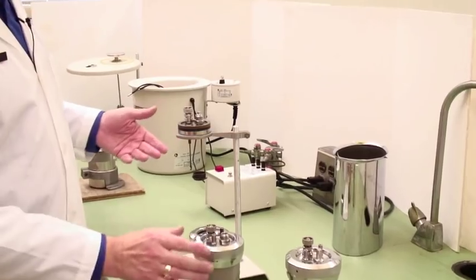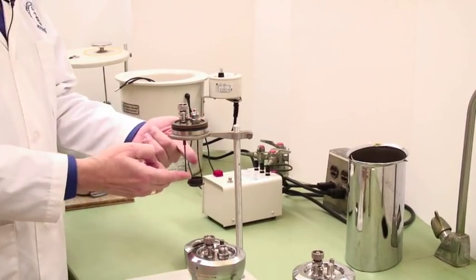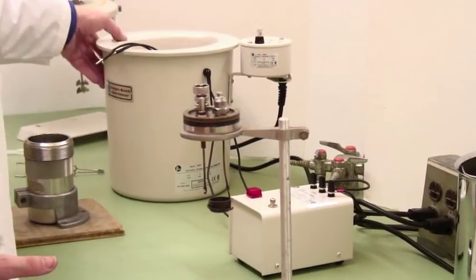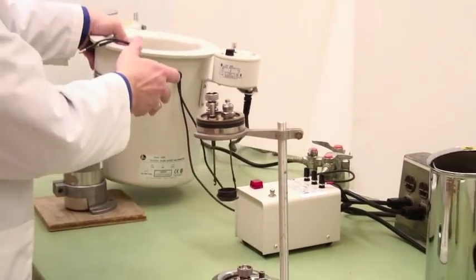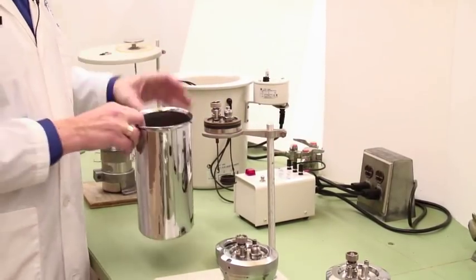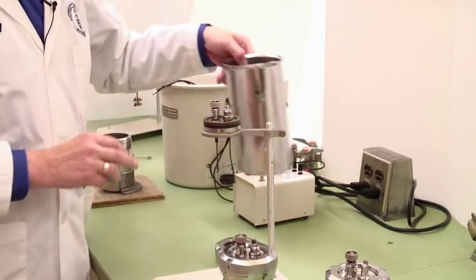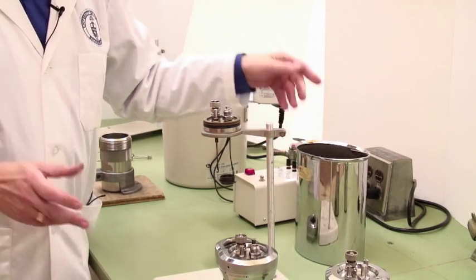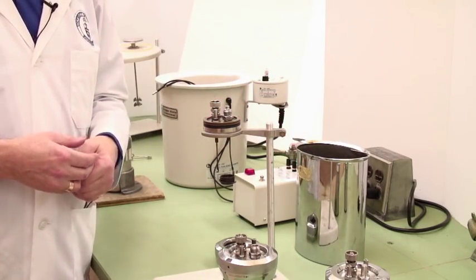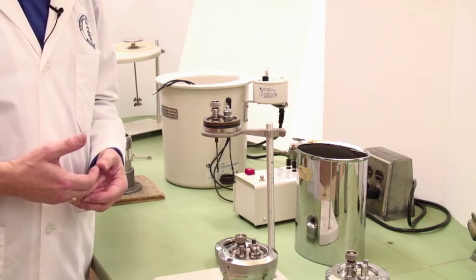A bomb calorimeter has a charge of something that will be burned in an oxygen atmosphere. We place it inside a calorimeter which is a bucket of water which sits inside an insulated container, and we measure the temperature before and after combustion and from that we determine how much energy was released.